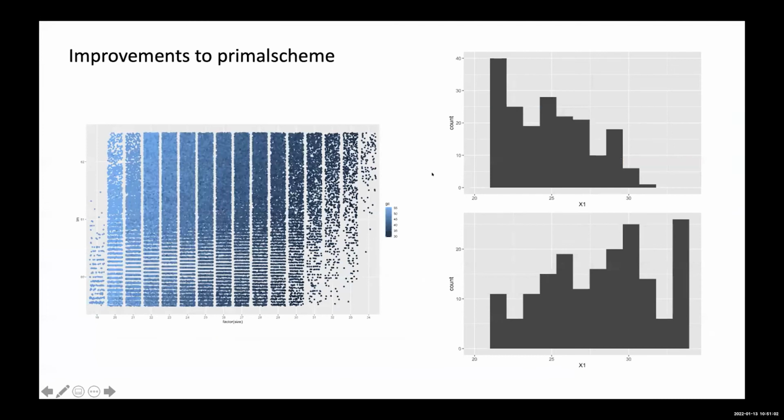And then I just quickly knocked this slide up a minute before the talk to cover some of what Andrew was saying. But we used to try to, and this is a dogma within PCR that's been around for a long time, which is that the ideal primer length is about 18 base pairs for PCR.